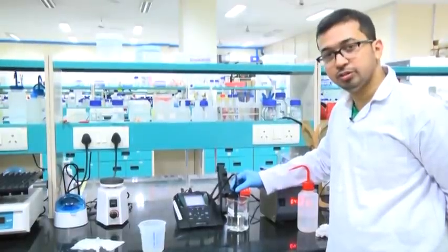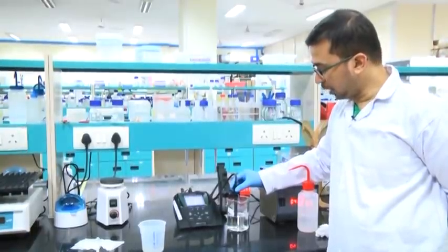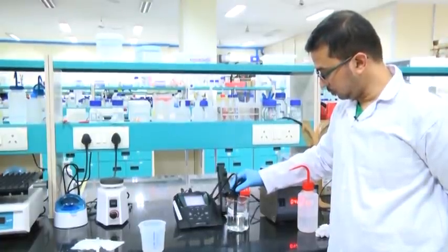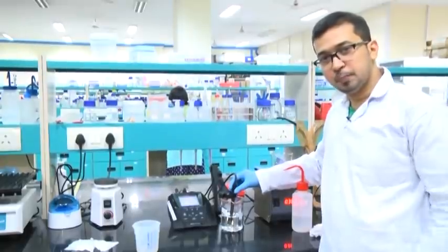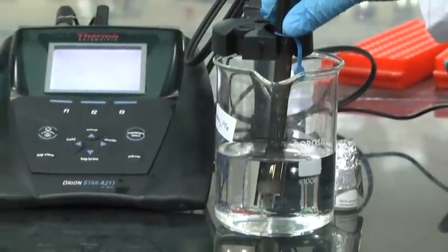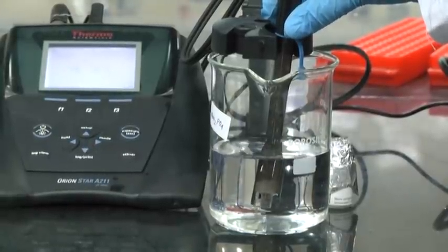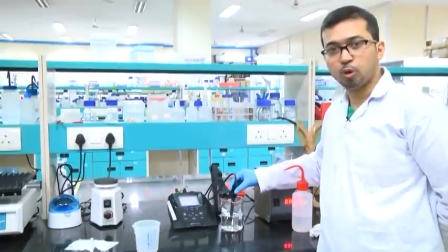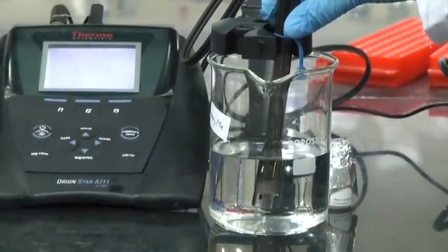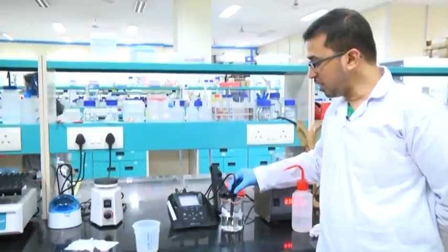The pH of this 100 millimolar sodium phosphate monobasic comes to around 4.35, which is in the acidic region. Here we can see the pH is 4.34. The value mentioned in literature is generally 4 to 4.5, and it is coming to 4.34. So we have prepared 100 millimolar sodium phosphate monobasic solution, 250 ml, with a pH of around 4.34.